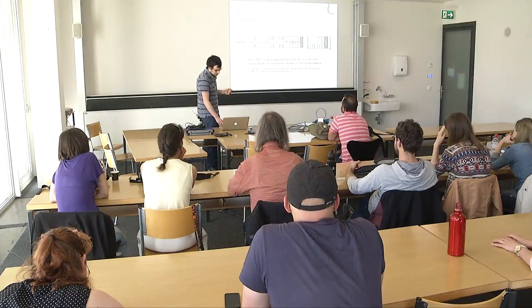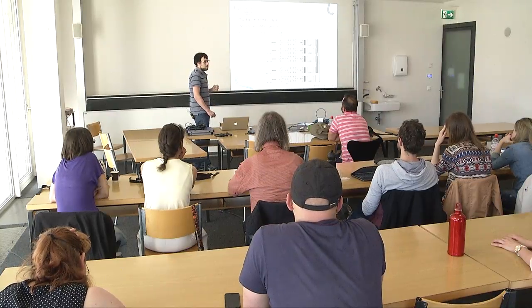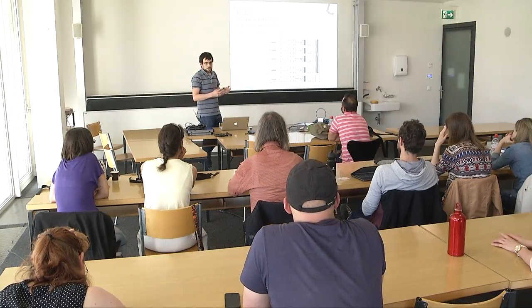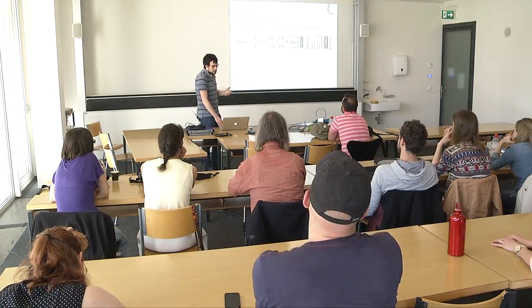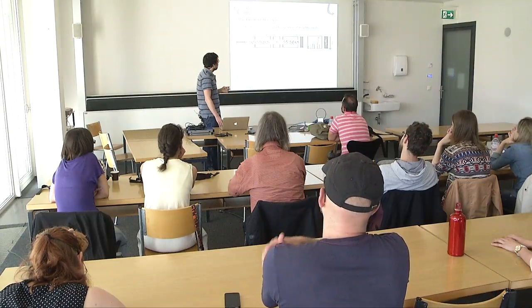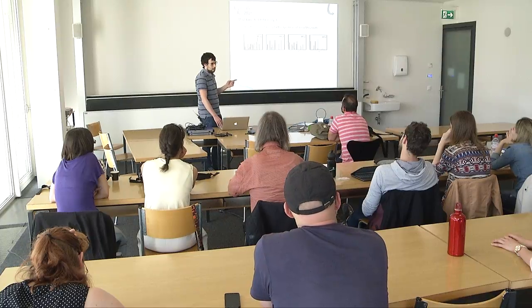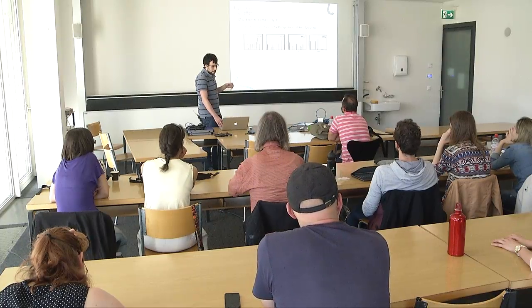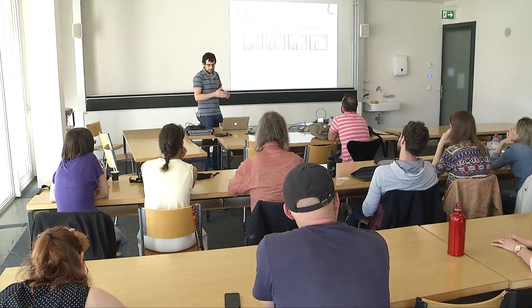So this is the MSE, and we also have, for example, SWATH type of data, in which instead of isolating the whole mass range, we do it in windows, right? But the strategy is exactly the same. So we can align, as you have seen during the course, these MS2 spectra and then ask which are the fragments that are co-eluting in time, right? And in this way, identify the peaks.